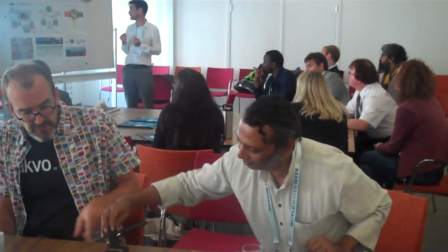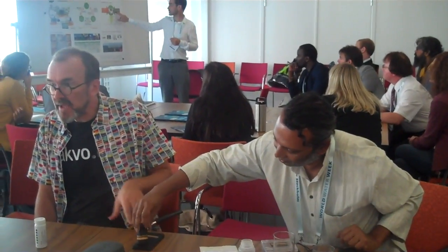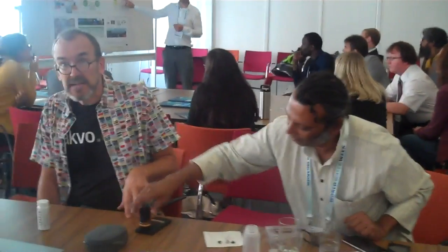So you will see this color change already. It's sort of purplish. Right? And the first version was developed just based on the camera in the mobile phone and the flash. Right? And you start a fluoride sample test.